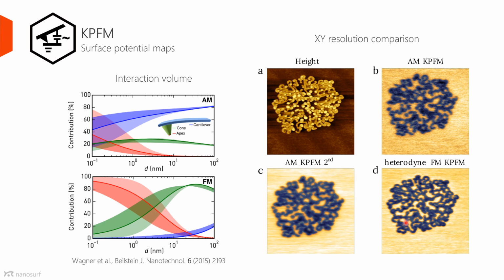In which situations might it not be an advantage to use these techniques? Well, if you have a probe with a very high Q factor, for instance, it might not have much signal at the second harmonic because it might be too stiff. Or if you use a technique that involves some sort of excitation at a mechanical frequency or one of the harmonics of the mechanical resonance, you might induce defects in the topography tracking.